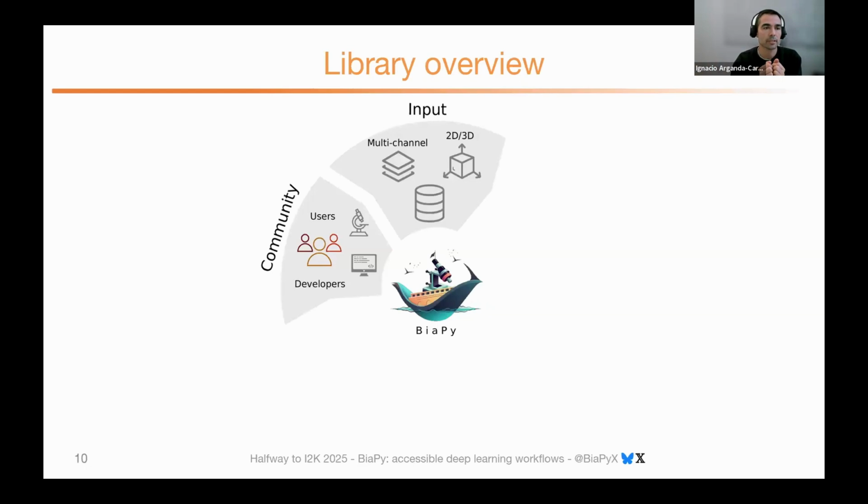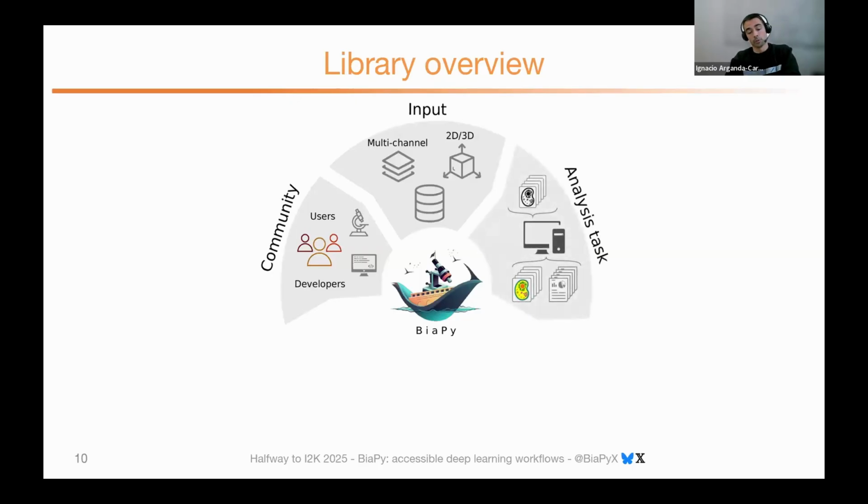They could be just a few megabytes, or terabytes of data that we have to handle. And for that, we target a few analysis tasks, not all of them. So we will see, we have segmentation, detection, etc.